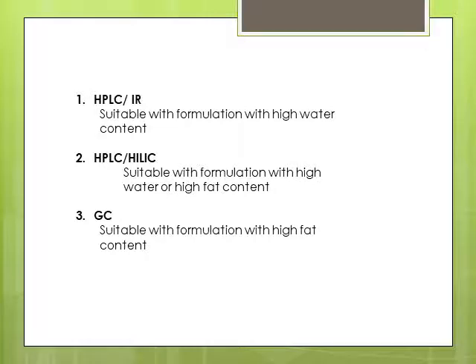GC is suitable for formulations with high fat content like ointments, or formulations that have a lot of white petrolatum and mineral oil. So you should use heptane or hexane for the extraction method.